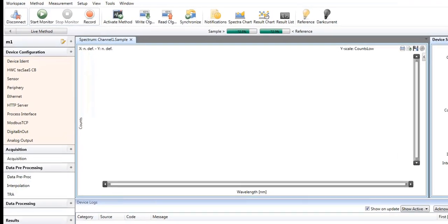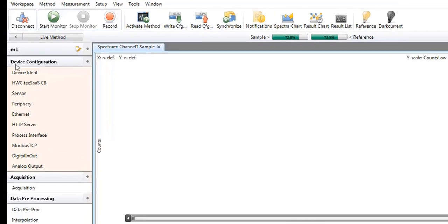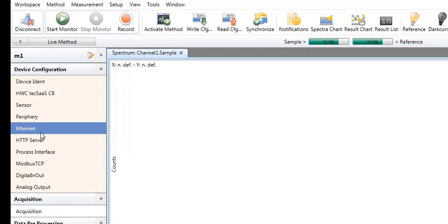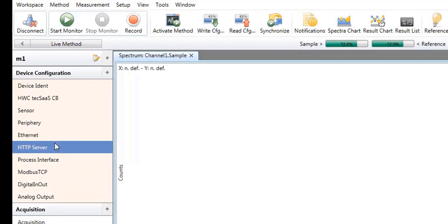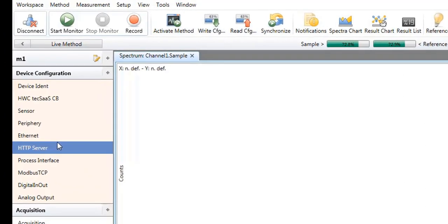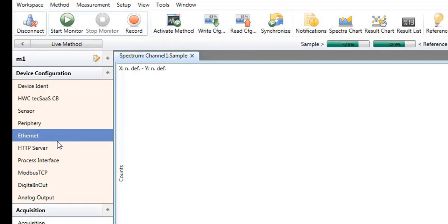At the left, you will find the method configuration showing all data acquisition and processing steps, also called method steps, and allowing their parameterization.